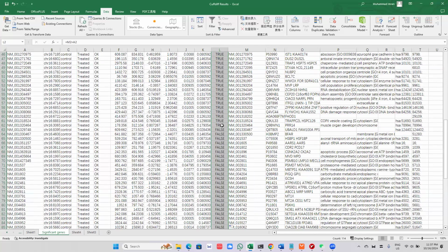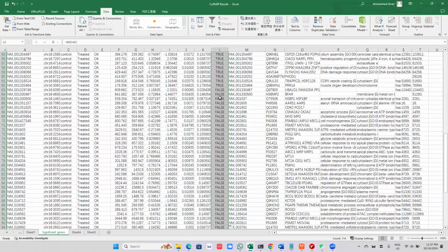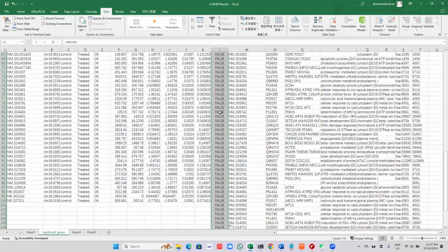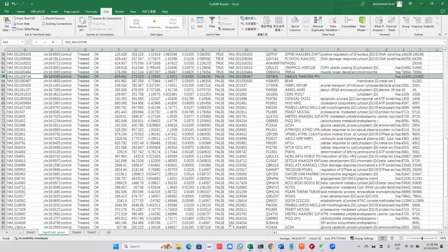Now, ma'am, how to sort the false entry? Can you see the false entry here? Yes, ma'am. Just select this 63 row. Can you tell me which ID is not matching from our data? Ma'am, the 748. Correct. Can you see the ID on the left-hand side ending with 748? So it is not matching, correct?